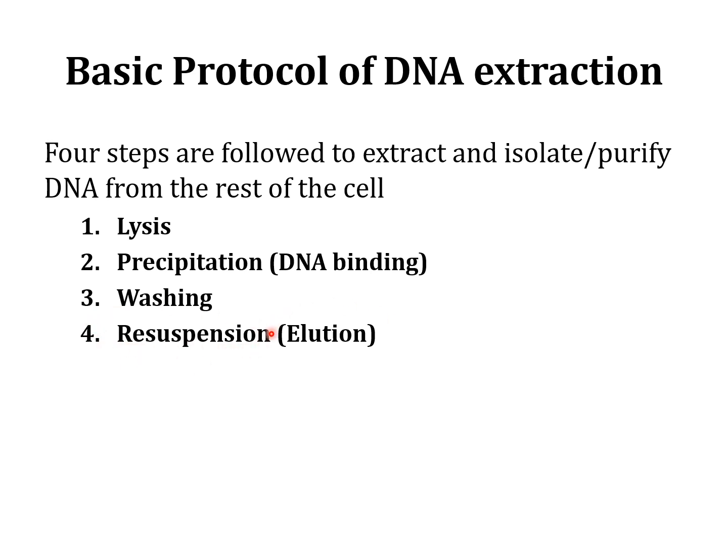In the kit, we have a similar procedure called elution. Elution is basically where we remove the clean DNA from the filter, based on charge. I'll explain later on so we can use it.